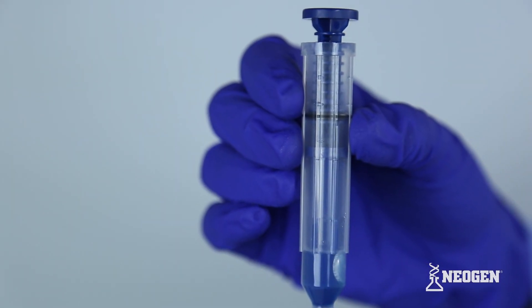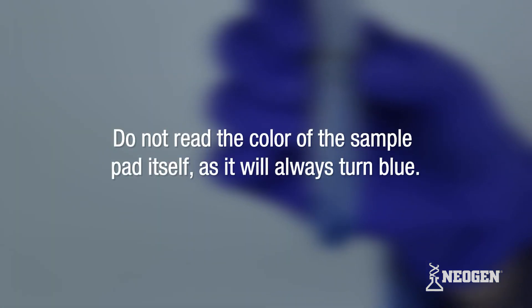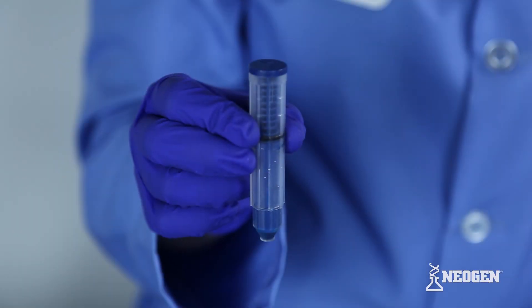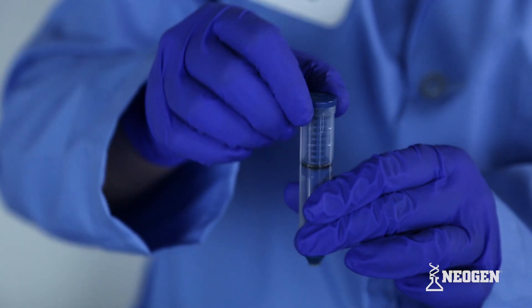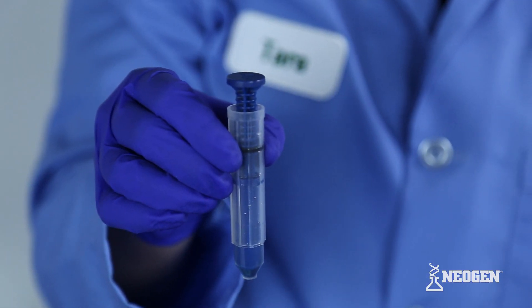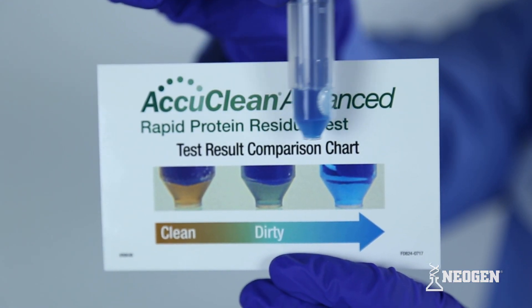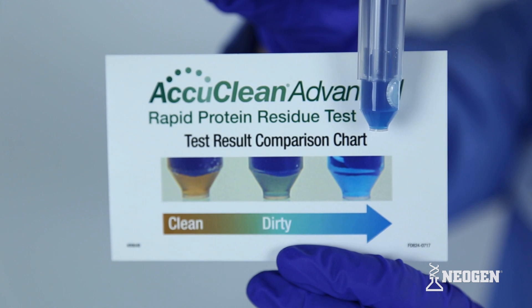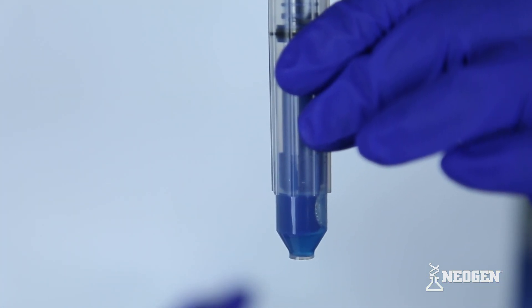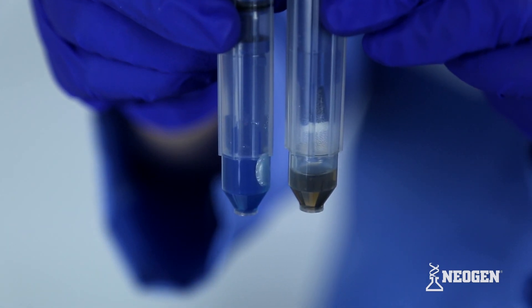Test results are interpreted by examining the color of the remaining solution. Do not read the color of the sample pad itself, as it will always turn blue. It may be helpful to pull the sample handle back up enough to remove the sample pad from the liquid prior to interpreting results. To determine the results, examine the color of the remaining solution using the provided color comparator. Examining the solution in front of a white background or next to a blank unused sampler may also assist in interpreting the results.